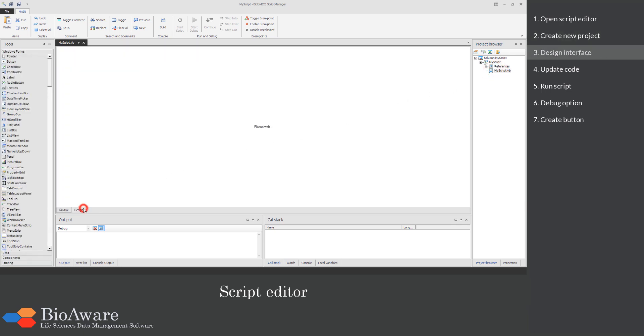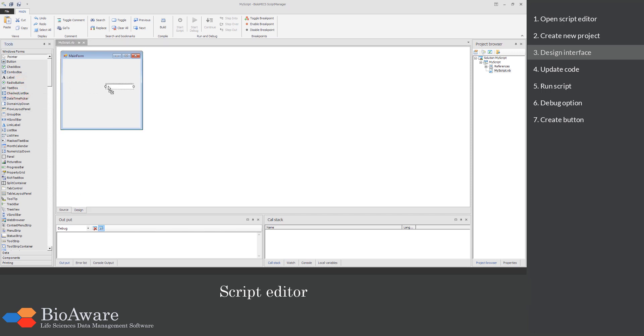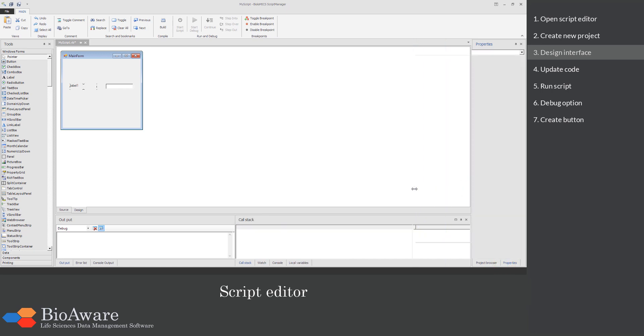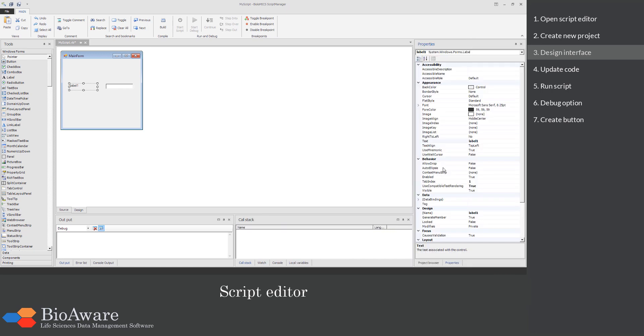Click on Design to build the interface for the new functionality. Here we will add a new textbox where the user can enter a value. We use the label to provide the instructions. In the Properties section you can adapt the displayed text.